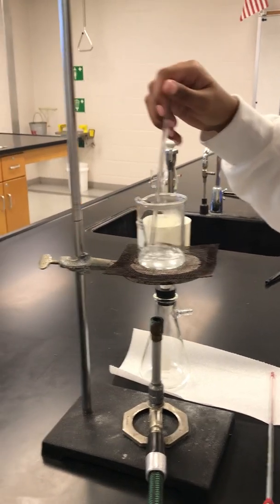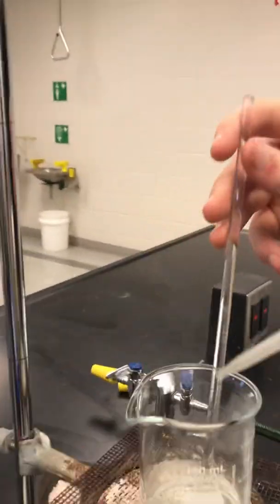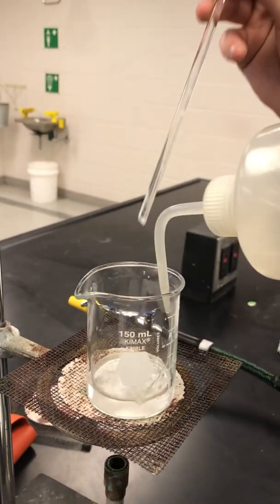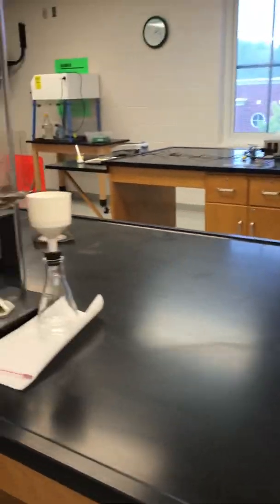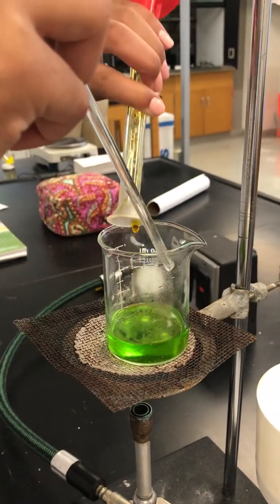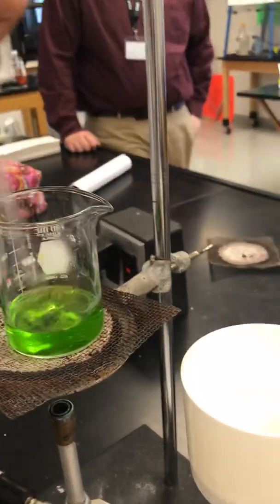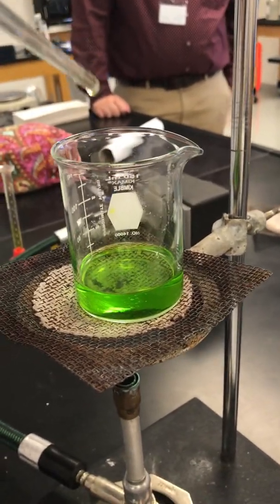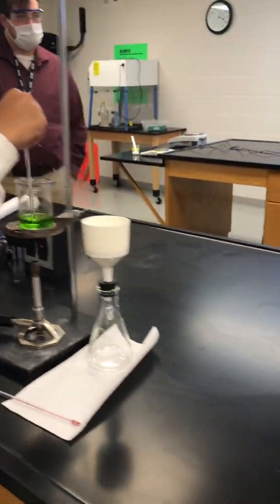Just keep stirring and get that last little bit, and then you can add it in. So now she's going to pour in her 8 milliliters. Stir it. Now see how you have a little bit of solid on the end of your stirring rod? Most of it came off as you did that. So if it's fully dissolved — green. Correct. Yes.